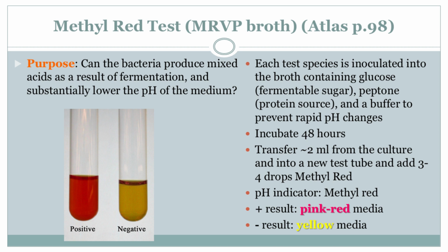You probably know it better as E. coli. Oh, yeah, E. coli. Everyone's heard of E. coli. Right. So E. coli, which is commonly found in the intestines of humans and animals, would give you a bright red methyl red test, meaning it produces a lot of stable acids. It uses a process called mixed acid fermentation to break down glucose. So E. coli loves to make that broth acidic. You could say that. Yeah.